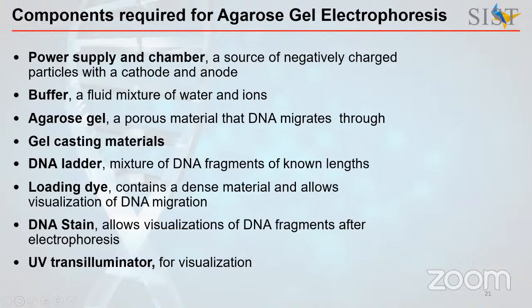So just by looking at the loading dye, because you can't see the DNA migrating with your naked eye, right? So addition of loading dye makes it easy for us to visualize the DNA migration. And then we do need DNA stain.